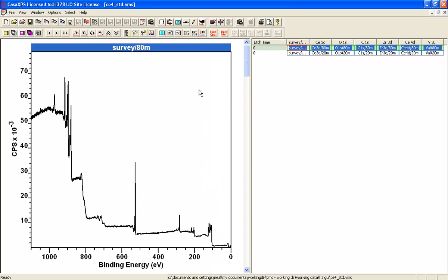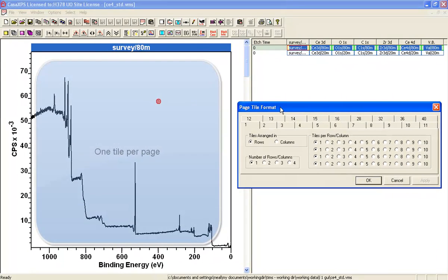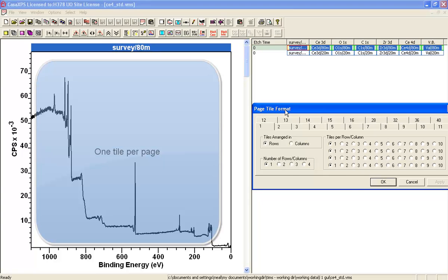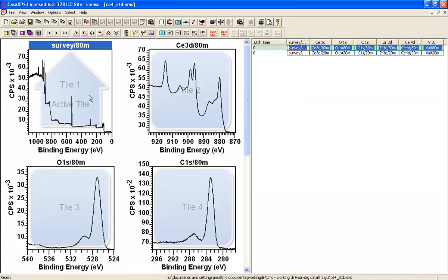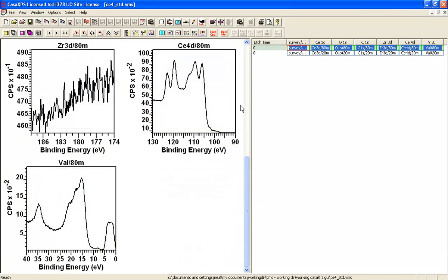We can display more than one tile per page using the Page Tile Format dialog window. If I select four and press OK, you now see four tiles per page, so the number of pages is reduced as indicated by the scroll list.